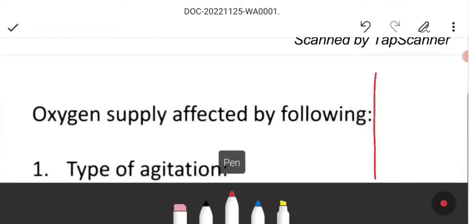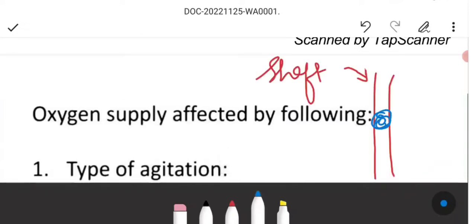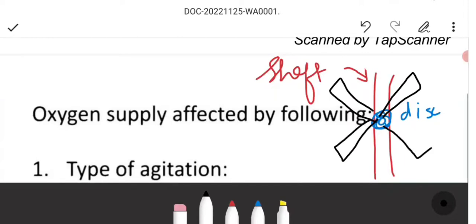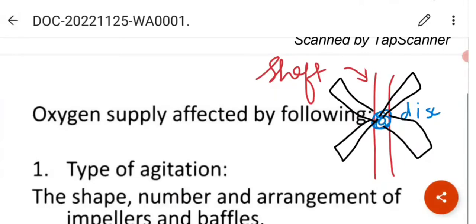This is known as the shaft. Shaft is on top of which is a small disc. This is the disc. And this disc is on top of the blades. These are the blades.